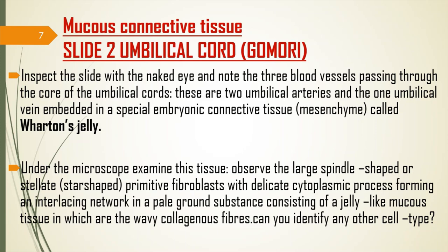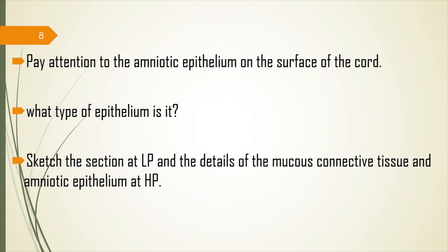The first type we're going to look at is mucus connective tissue found in the umbilical cord. Inspect the slide with the naked eye and note the three blood vessels passing through the core — two umbilical arteries and one umbilical vein — embedded in an embryonic connective tissue mesenchyme called Wharton's jelly. Under the microscope, observe the large spindle-shaped or stellate, star-shaped primitive fibroblasts with delicate cytoplasmic processes forming an interlacing network.